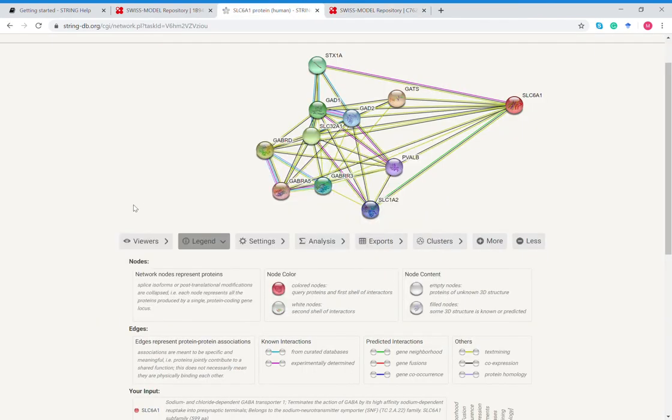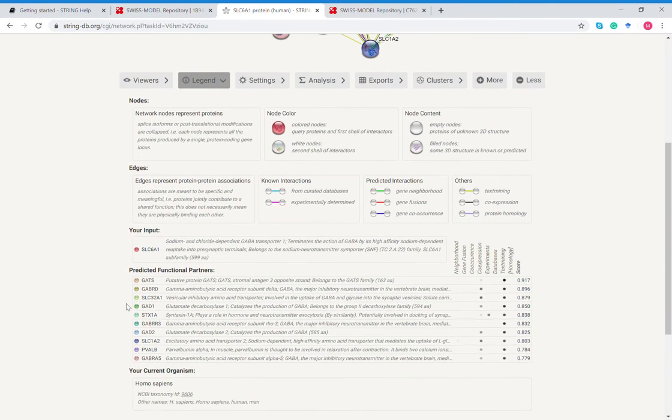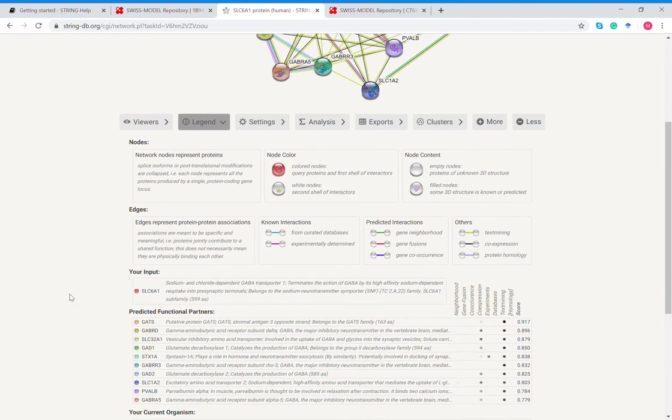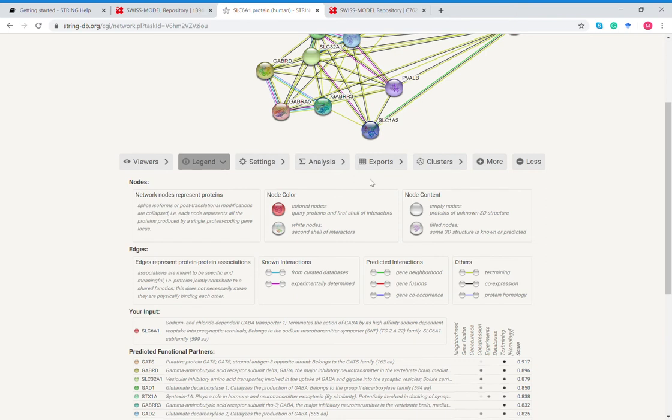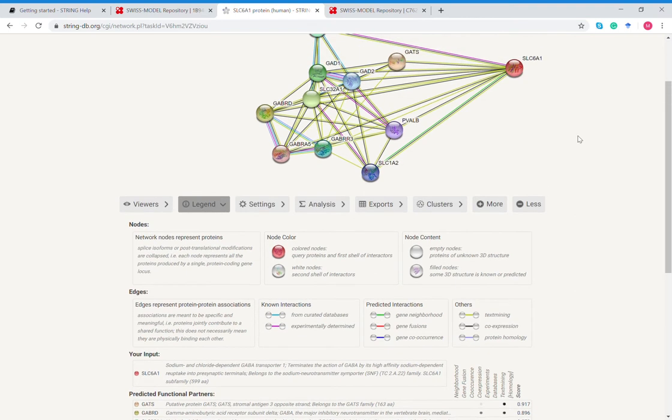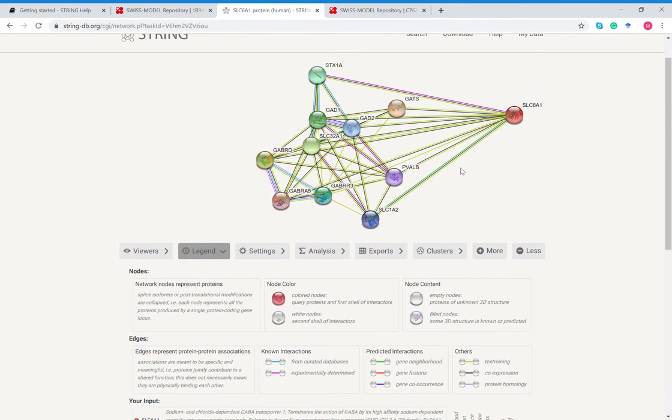The colors just indicate a different type of protein. The lines, so the color of the lines, you have known interactions, predicted interactions, or others that come from text mining, coexpression, or protein homology. So like this has different types of greens and it's got a blue, there's one known, and there's a black, so there's actually two others that are predicted. The red color means that is the query protein and the first shell of interactions.